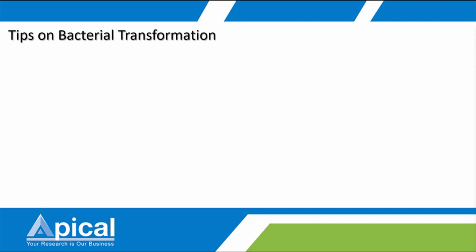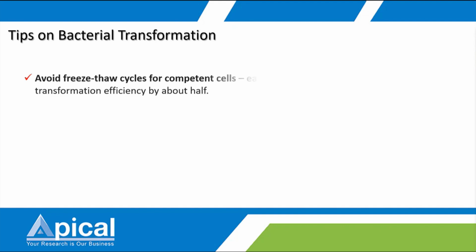Okay, a little bit on the tips for bacterial transformation. First, for the competent cells, you can prepare them a few days earlier, but avoid many freeze-thaw cycles.